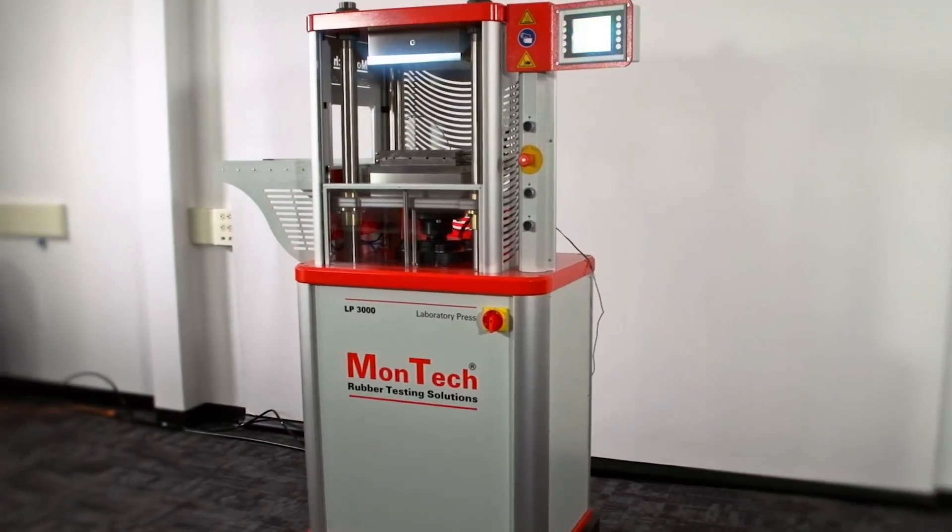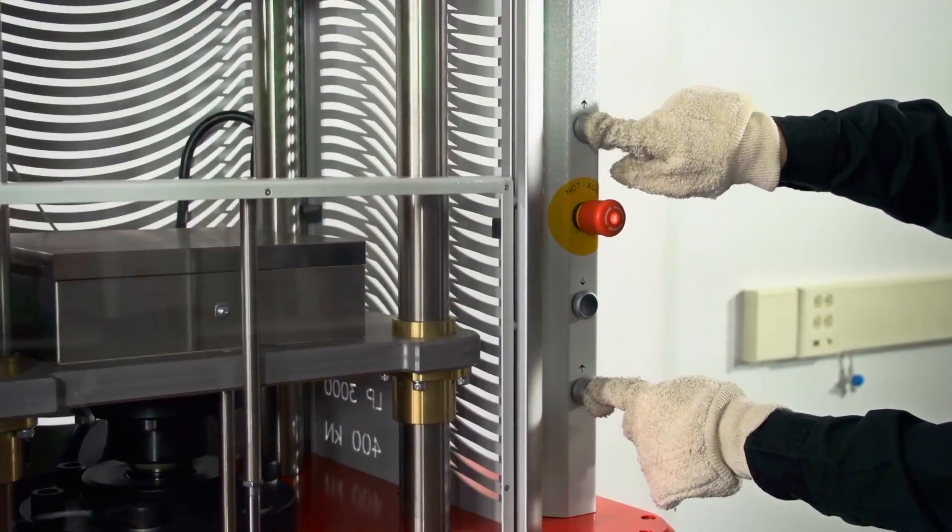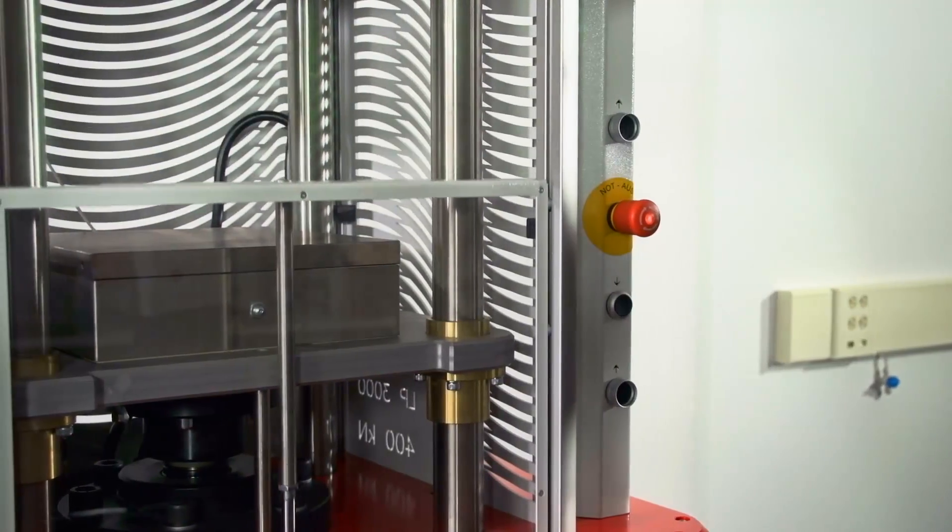Montec designed the LP3000 with safety in mind. Each press is operated using two-hand safety control with anti tie-down safeguard and has a pneumatic safety shield to isolate the curing chamber while in use.